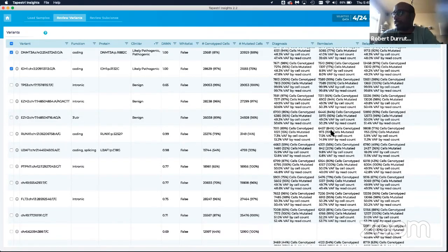There are a number of different key factors. Number one, as you can see, those 14% are relatively level across the board. So 15%, 15%, and about 12%. If it is an artifact, you would assume it's sample independent and systematic across the board, like 15, 15, 12.